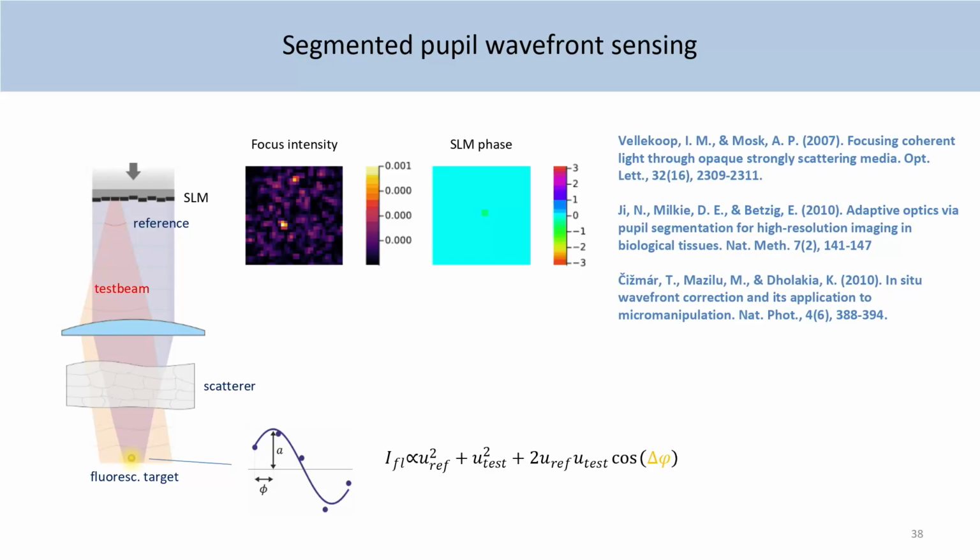I refer to these methods as interferometric methods. Why? Because they actually do interferometry. How they work, at least in this demo paper, is that they moved every single pixel on a pixelated SLM in time. Therefore, in the fluorescence target, or in the focal space, if you have a fluorescence bead, what you do here is phase stepping interferometry.